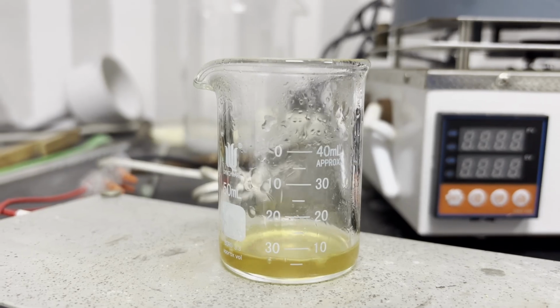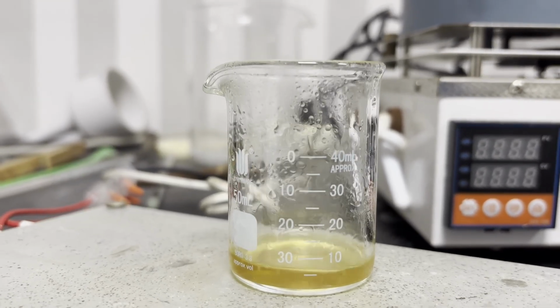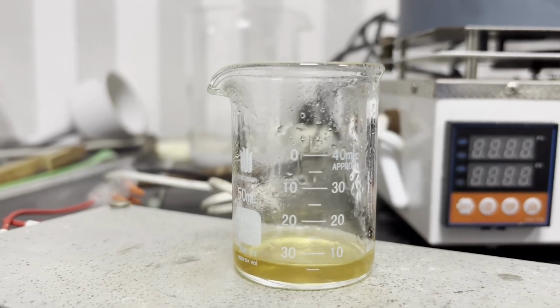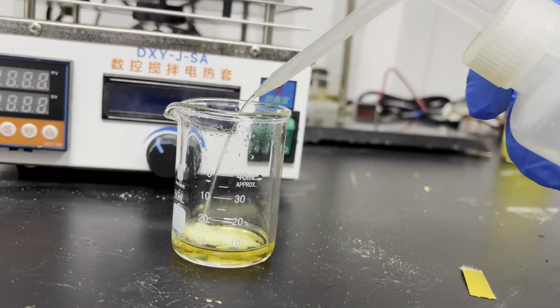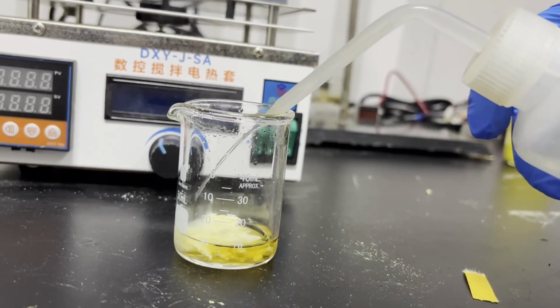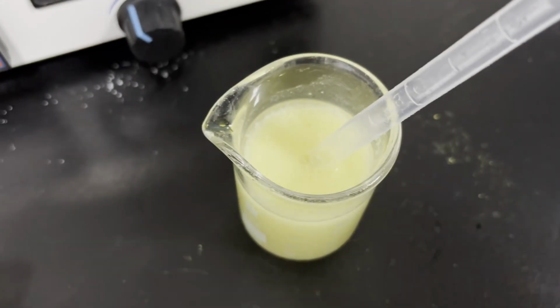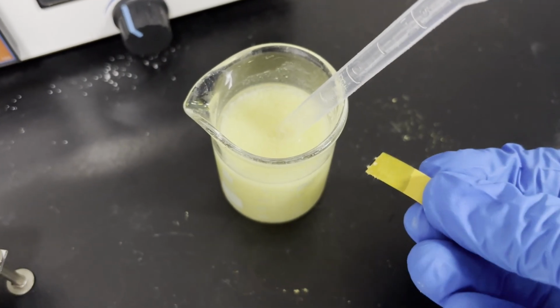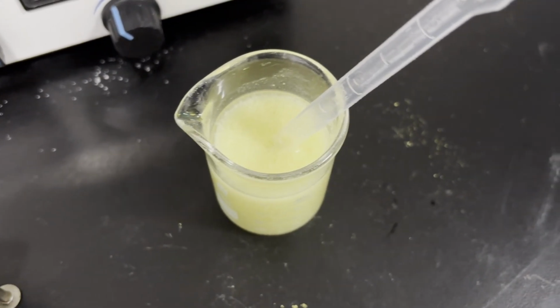Initially, remaining ethanol in the acridone salt boils off, and later some fumes of dimethylamine are formed from the DMF decomposing at high temperatures. I removed the heat and added a lot of water to precipitate our product, N-methylacridone. A pH test shows that no alkali remains, indicating that the potassium salt is indeed consumed in the reaction, and the methylation is probably complete, although I cannot be sure.